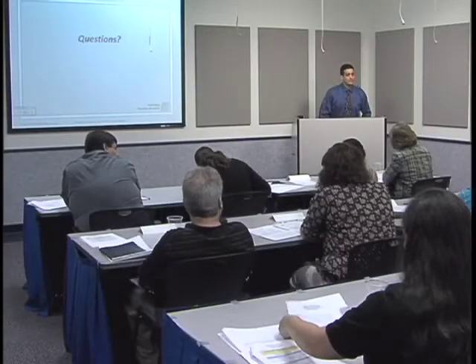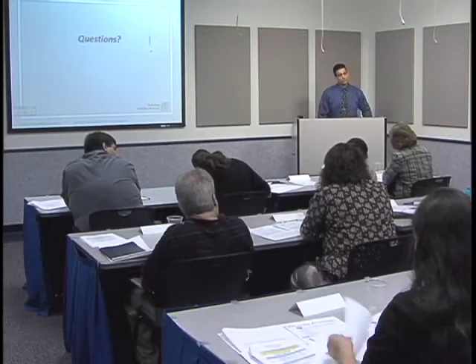Have you seen the application of this being put into casework laboratories, with what it's doing to the limit of detection and stochastic thresholds? Like, how much of a jump are laboratories seeing for stochastic thresholds?